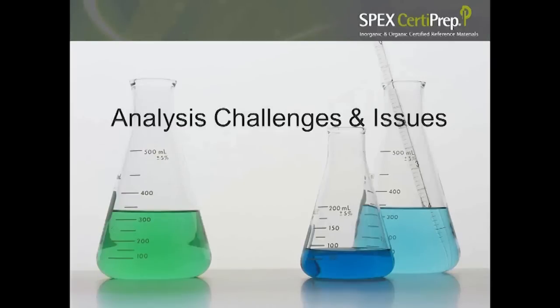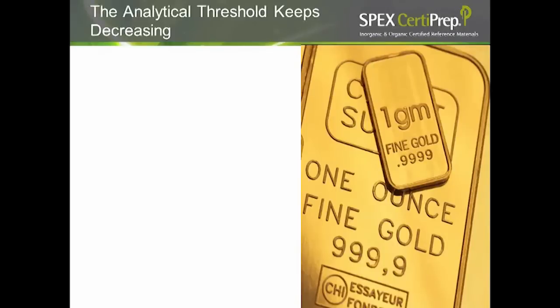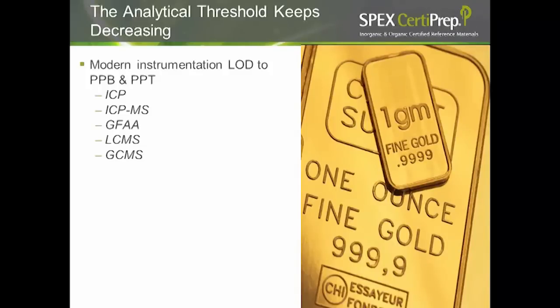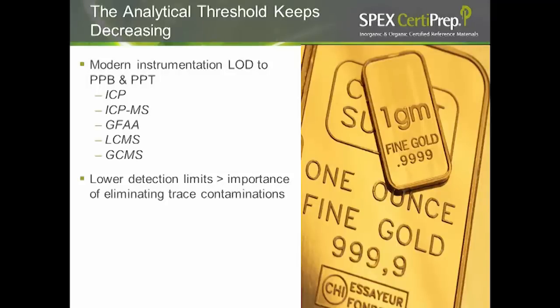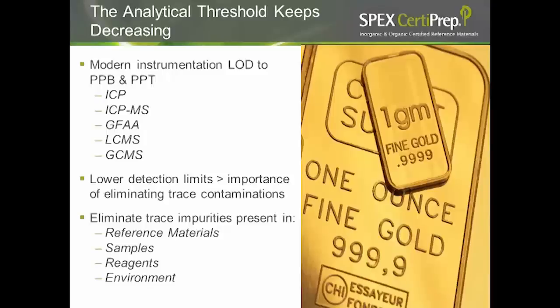Now we'll look at some analysis challenges and issues you might face in the lab when it comes to error and cleanliness. The biggest challenge is that our analytical threshold keeps decreasing. Modern instrumentation's level of detection has been dramatically reduced to the ppb or ppt ranges. Lower detection limits mean greater importance of eliminating trace contaminations — in reference materials, in your samples, in your reagents, and in your lab environment.